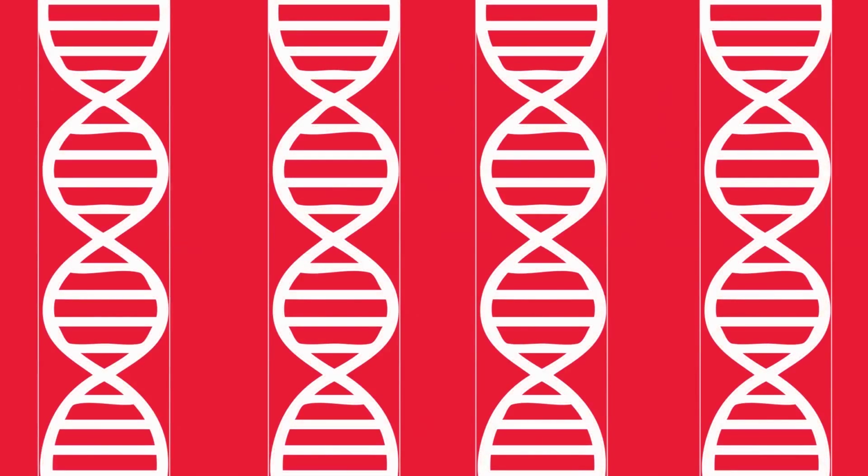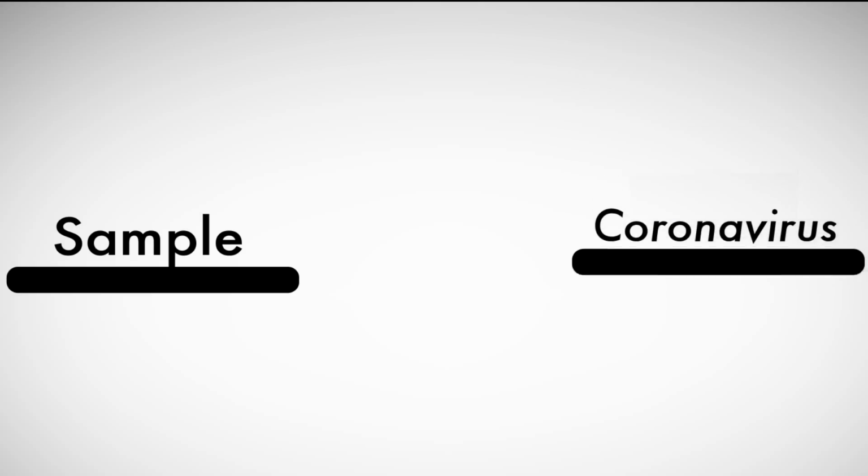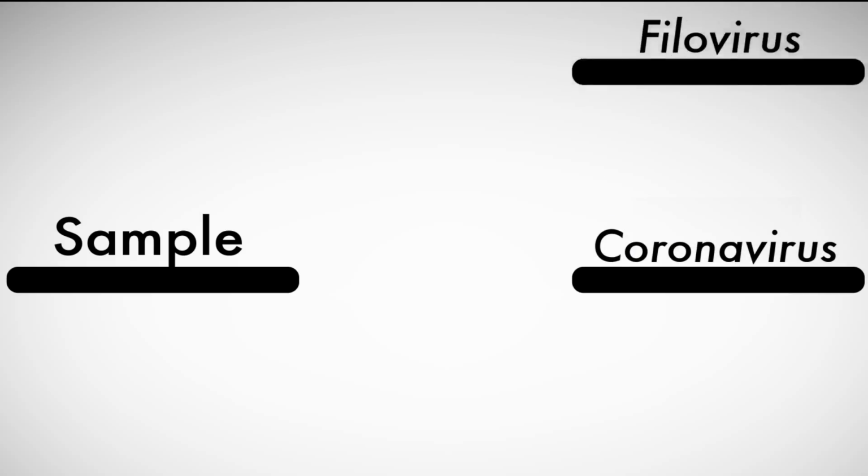We can screen a large number of samples and get a sense of what diversity of viruses exist within the samples that we collect. One of the things we can learn is how a new virus is related to other viruses within that family. So whether it's something we're concerned about like SARS or MERS, if we're talking about coronaviruses, for example. From there, we can decide if we need to generate additional data to learn more about this virus.